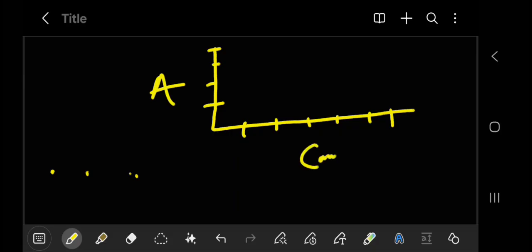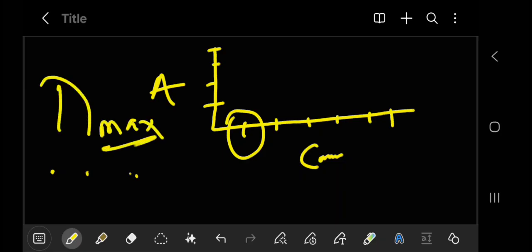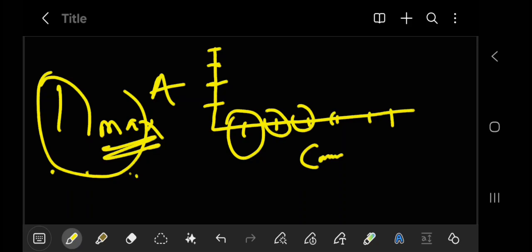You take the first one and put it in the spectrophotometer that has been set at the maximum wavelength. Remember I said this: the spectrophotometer is set at the maximum wavelength of absorption in the first stage of the procedure. That is the aim, to know the maximum wavelength. So don't forget that. The solutions you prepared, you now subject them again to find their individual absorbances. They'll give you different absorbance values.